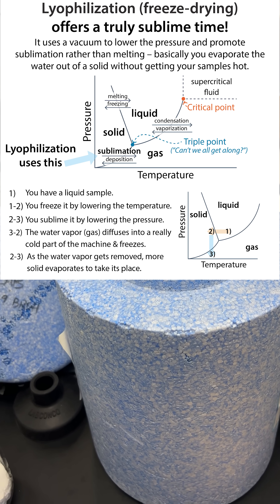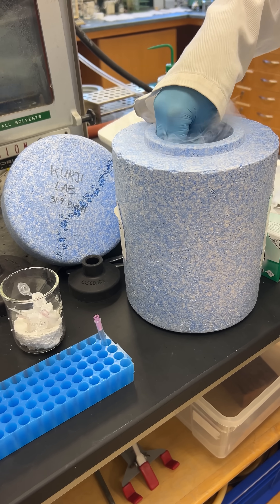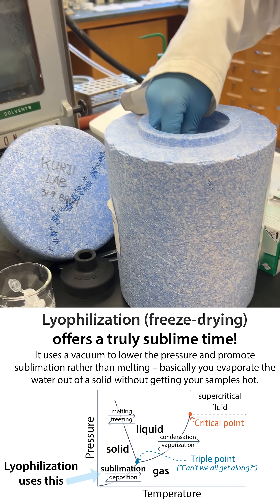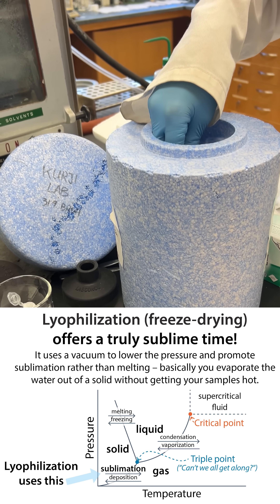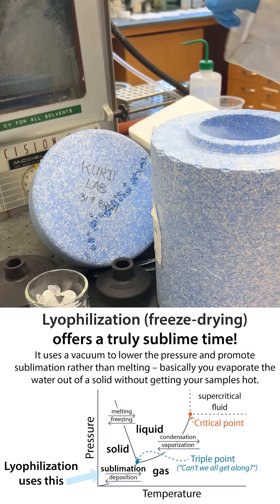So what is lyophilization? It is basically freeze drying the samples — we skip the liquid phase. We are able to sublime our samples, going from a solid to a gas. We get rid of that gas, which in this case is just the water. We remove all the water from our sample and make it into a powder, which we can then use because we need solid samples for the IR.